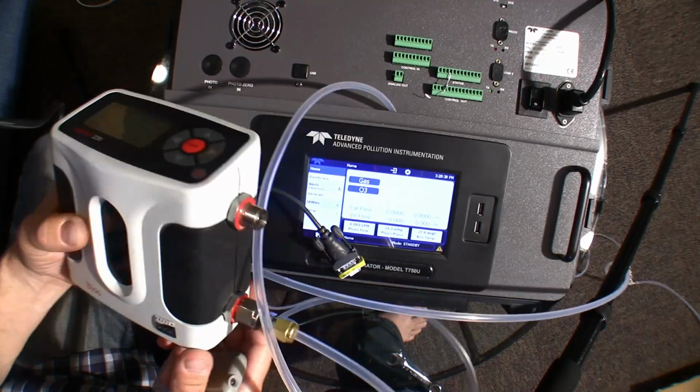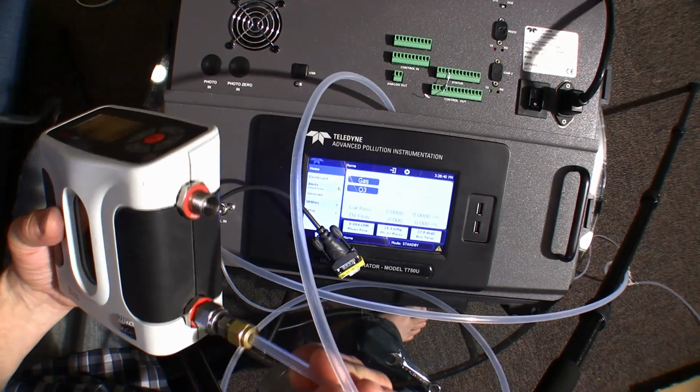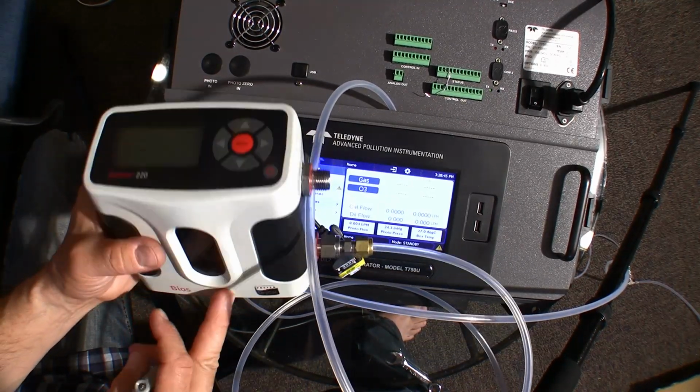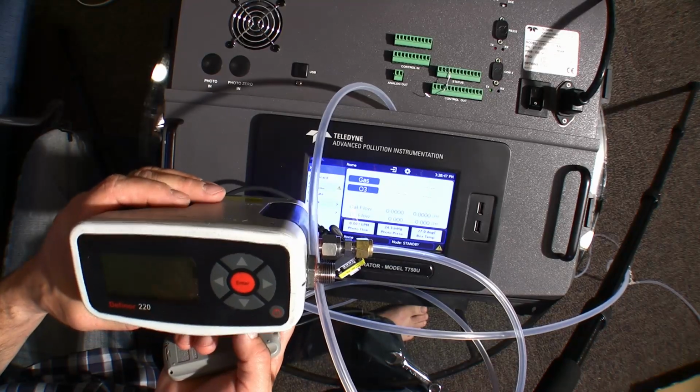Alright, so connected to the other end of that tube that we hook to our air MFC output, we're using in this case a BIOS DryCal model 220H.